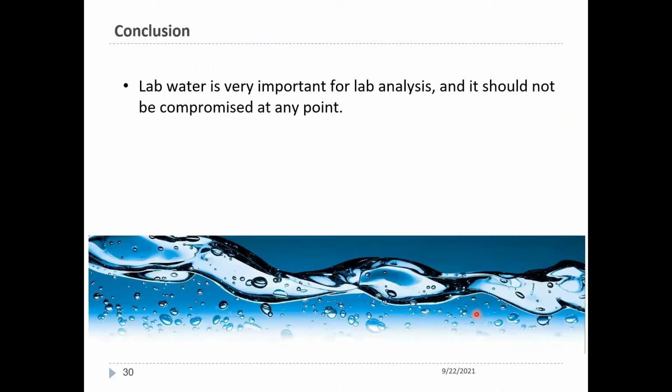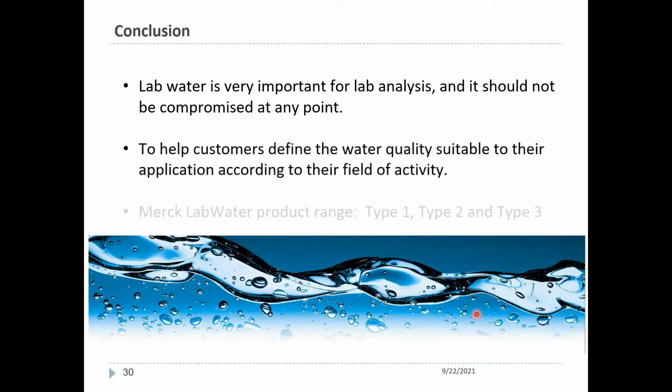So in conclusion, as we've seen through the slides, it's very important to have the right type of water for the right analysis. That's very important. So if it's washing of glassware, you use the right type of water. If it's the preparation of your media, the right type of water. If it's a blank you are reading in the UV spectrophotometer, you need the right type of water. If you are doing a critical application, HPLC, GC, GCMS, you also need the right type of water. And remember, water is the biggest reagent used in the laboratory, so we need to pay attention to that.